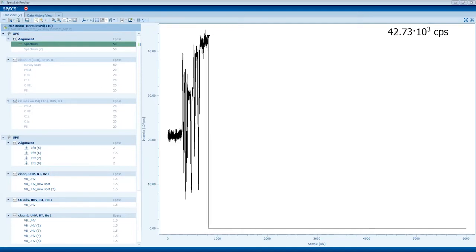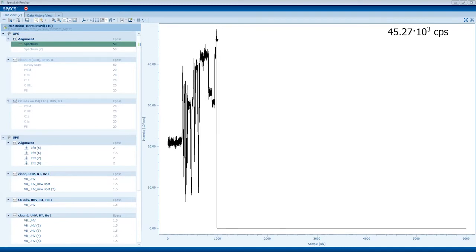So I was moving a bit with the beam. We have a monochromator, there are mirrors, and there are some regulators. You can rotate them a bit and move the spot on the sample. I was trying to put the spot exactly in the position where the signal is maximum, when the spot is in front of the aperture. You are looking for the maximum intensity, because maximum intensity means less time for measurement.